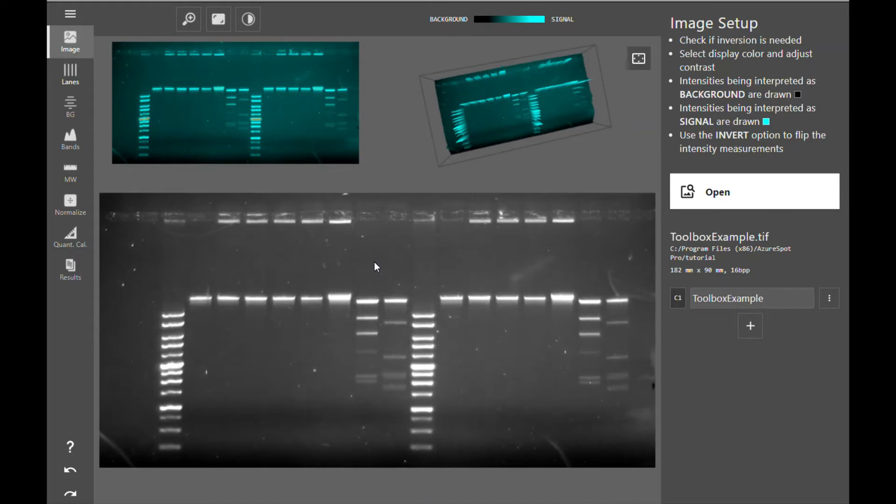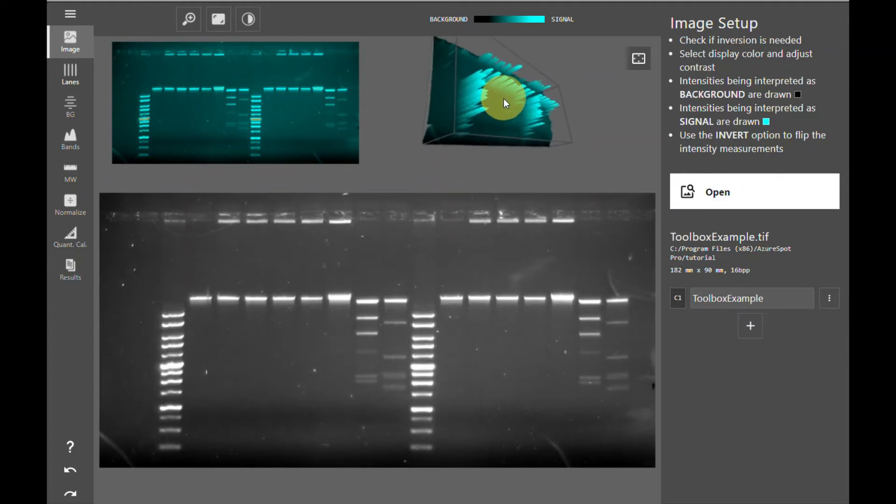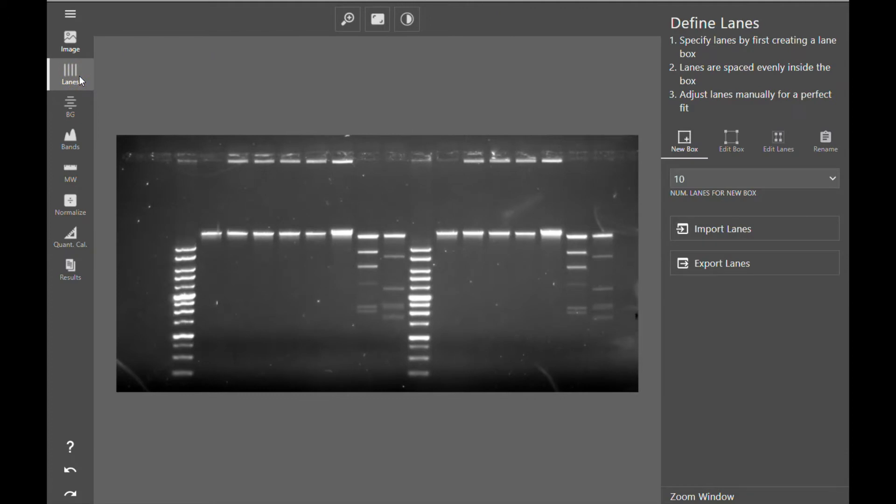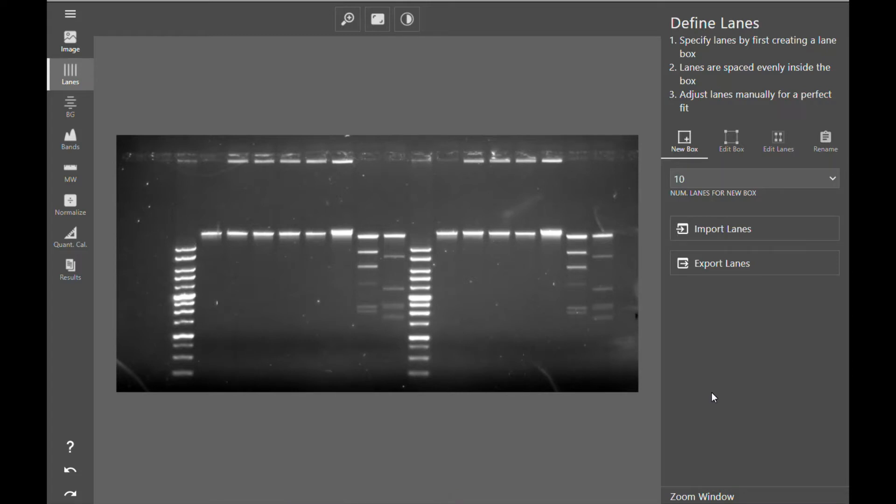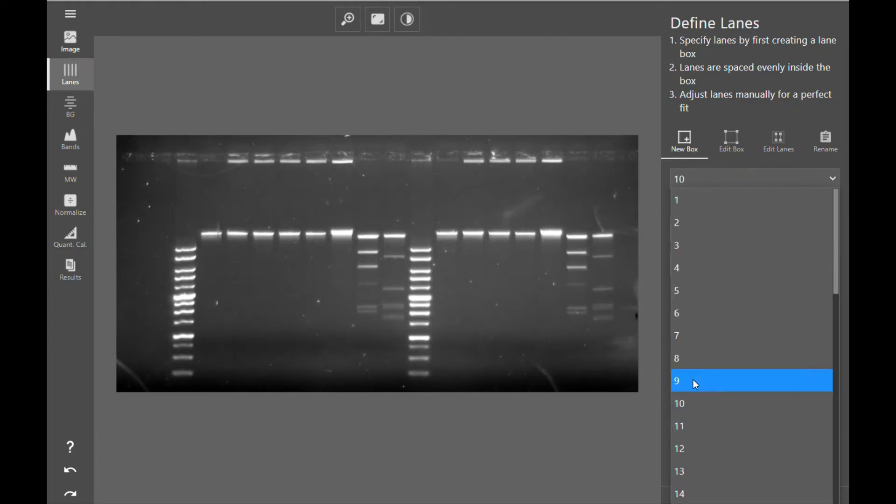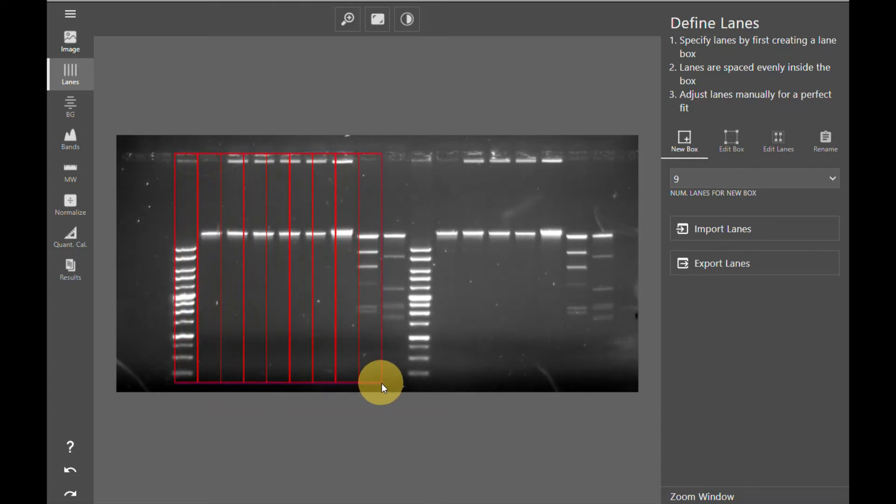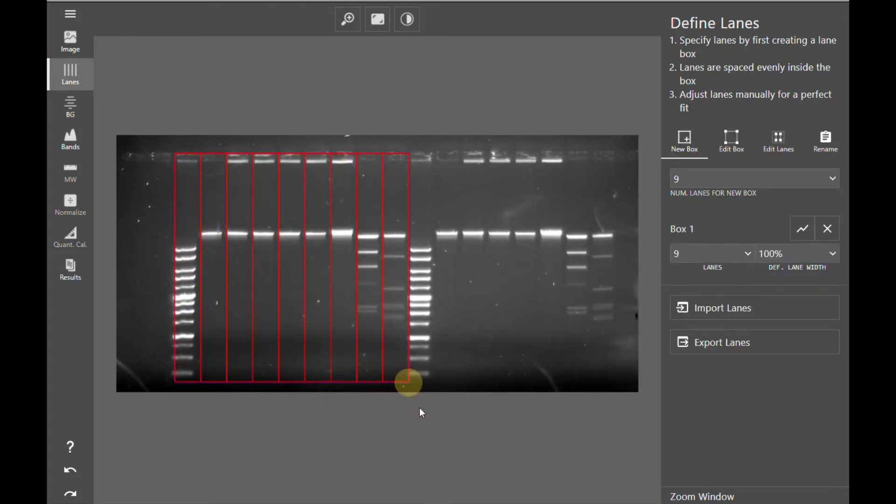Once you have checked for saturated pixels and verified that your signal is in the correct orientation for analysis and contrasted your image to your liking, you can move on to the next step of analysis, which is to create lanes. With Azure Spot Pro, you can analyze a single gel in your image or you can analyze multiple gels and blocks in a single image by creating multiple lane boxes. With this image, for example, I could create two lane boxes to analyze this gel as two separate sections independent of one another by creating two separate lane boxes.